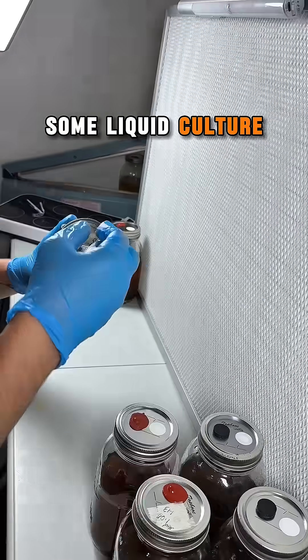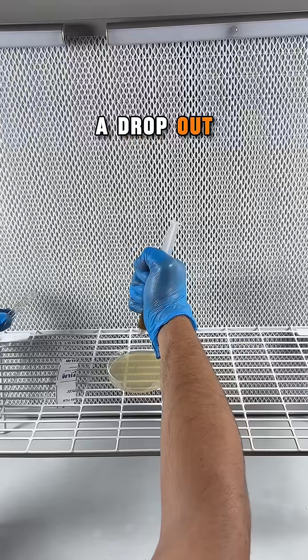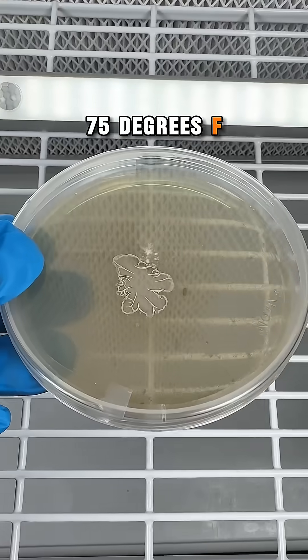Once I've extracted some liquid culture from each jar, I shake the syringe and then squeeze a droplet onto a nutrient agar plate. I seal the plate with parafilm and incubate at 75 degrees Fahrenheit.